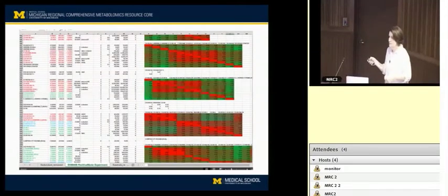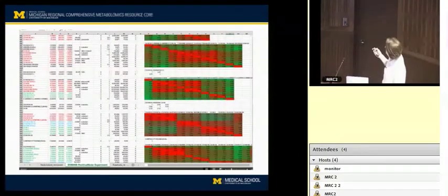So, figure out which two things are rising and falling together across the various samples, and calculate the Pearson correlation for those. Then once you separate them into bins, you can decide within a bin whether some things cluster together and have higher correlations than other things.